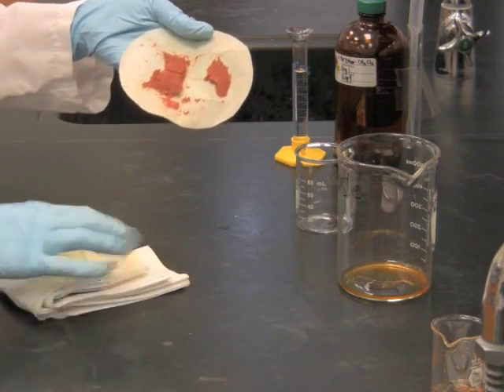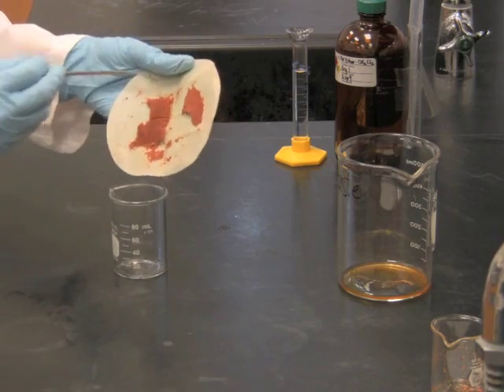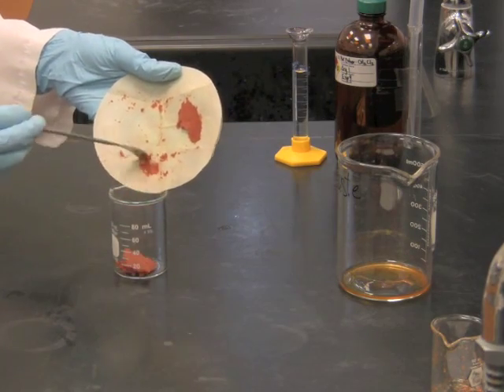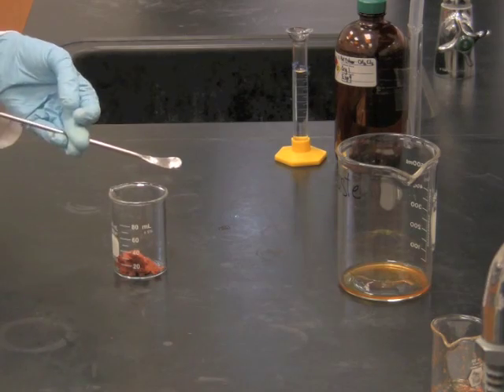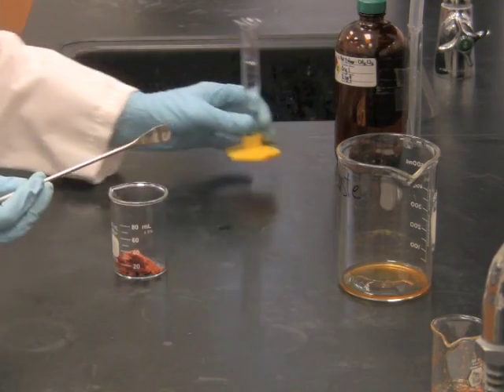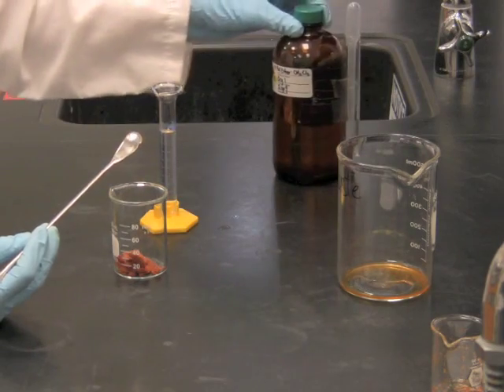Take the dehydrated tomato paste and transfer it into a small beaker and add 10 milliliters of a 1 to 1 mixture of petroleum ether and dichloromethane.